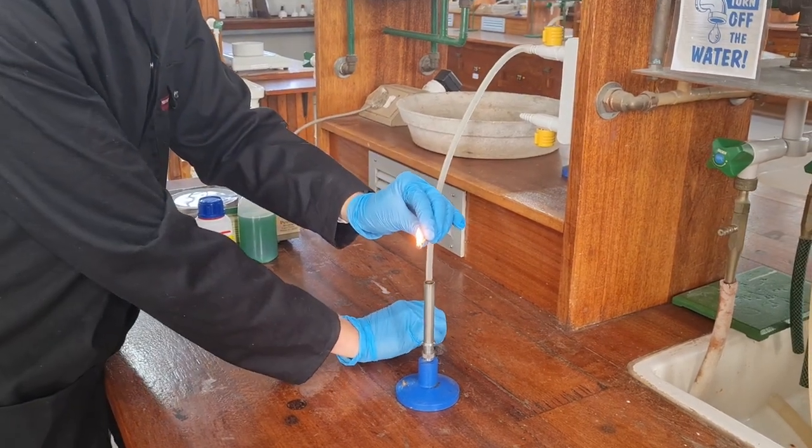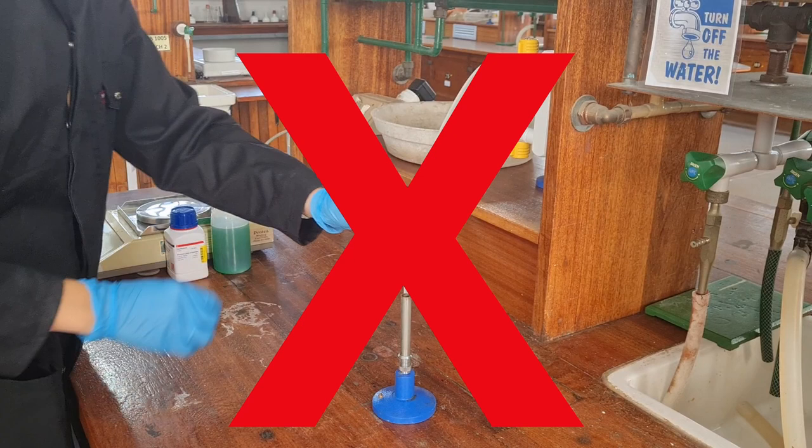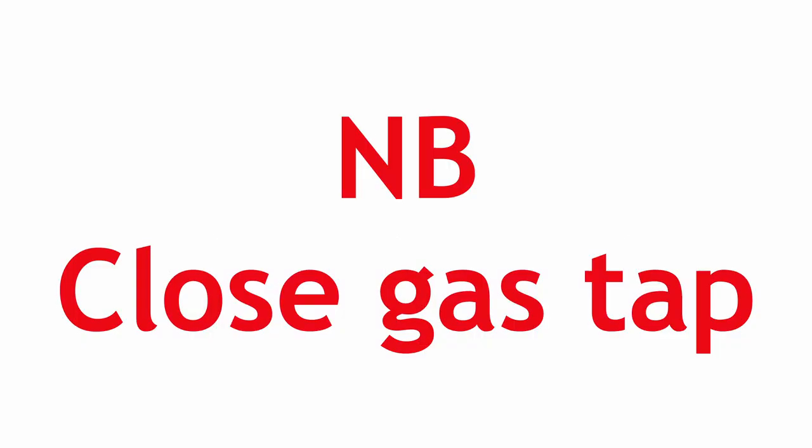Never cross your arms when lighting the Bunsen burner. Remember that the hand with the match is always opposite the hand closest to the tap. Never leave an open flame unattended. If the flame goes out, make sure to close the gas tap immediately.